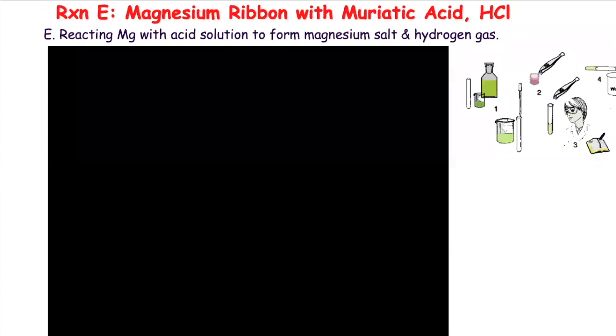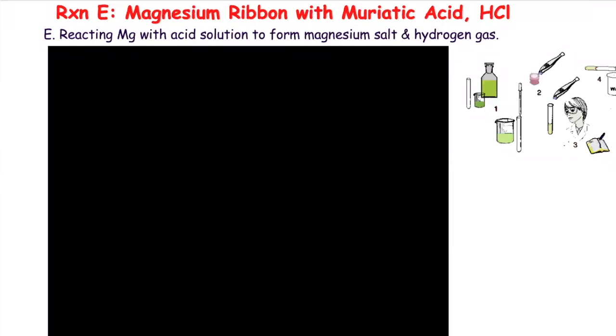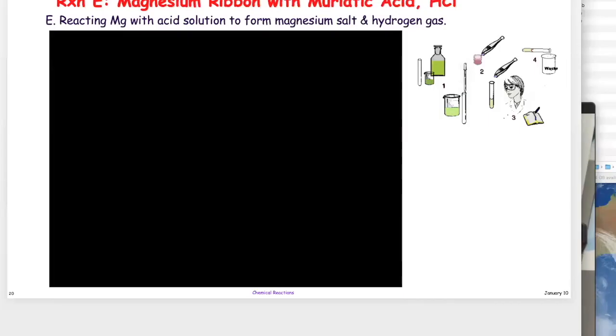One condition is just plain water, and then you guys are going to add phenolphthalein to this. The reason you want to add phenolphthalein is because you want to see whether or not the reaction is going to generate some sort of product. So let me show you this movie first.